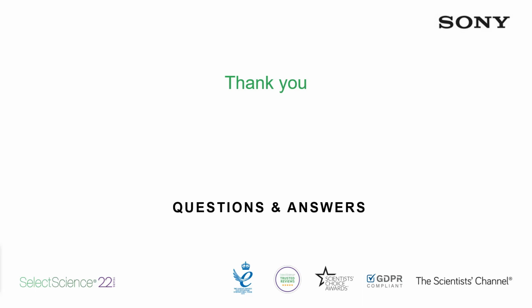That's a great question. So you generally want to use a nozzle size that's about 3 to 5 times larger than your cell size. But more specifically, the largest cell type is right around 30 microns, that we have going up to 50 microns with gel beads specifically. And the smallest is about half a micron, 0.5 microns.